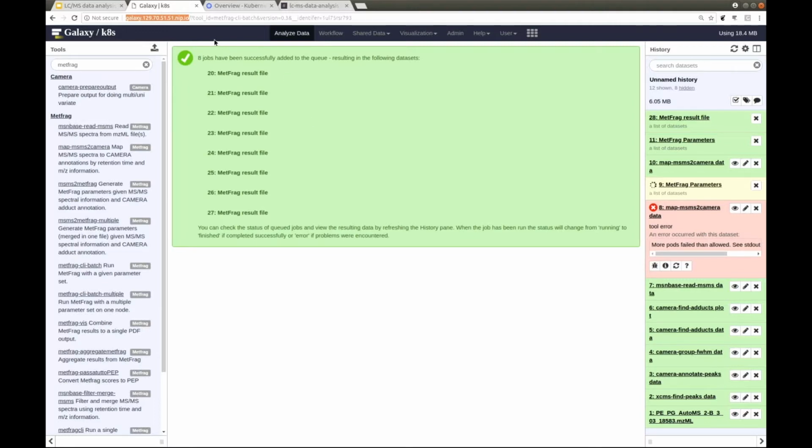If people want, I happen to be the administrator of that, and I've just pasted the URL into the chat window. You could then ask me for an account there, but in fact, it's not much different to the public instance that we are running. So you can simply also do that on the public instance of Phenomenal.